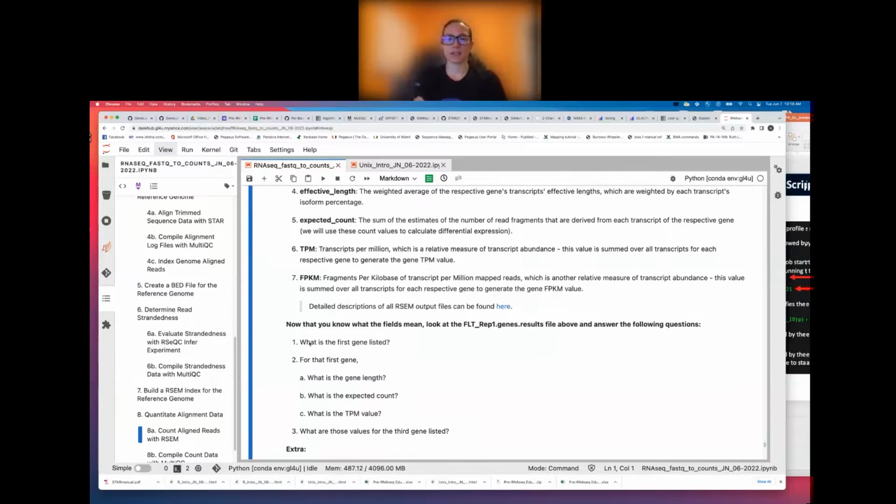So the first question, Armin, if you could cue it up, is what is the first gene listed? Armin did put the link in the chat again. So what's the name of the first gene listed?